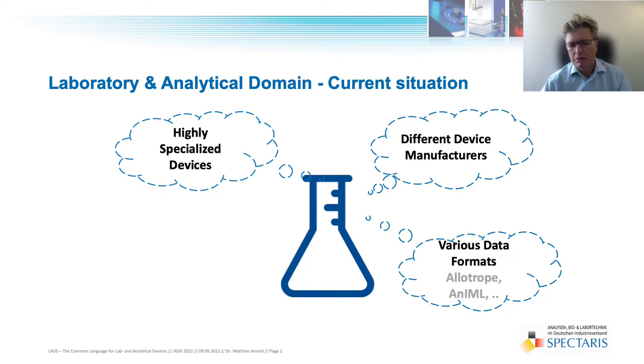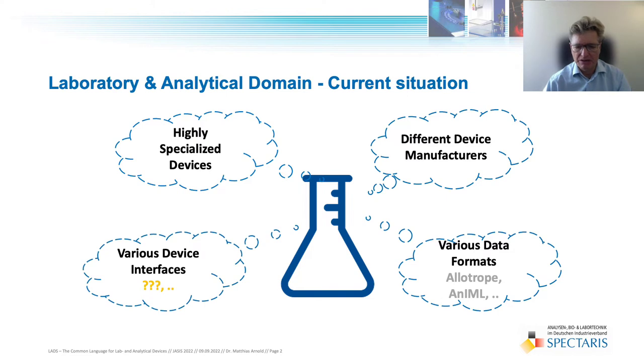However, when it comes to standardizing data formats, there are a few glimmers on the horizon: Allotrope, ADF, or AnIML, to name two prominent examples. But what about device connectivity in the lab and analytical domain?